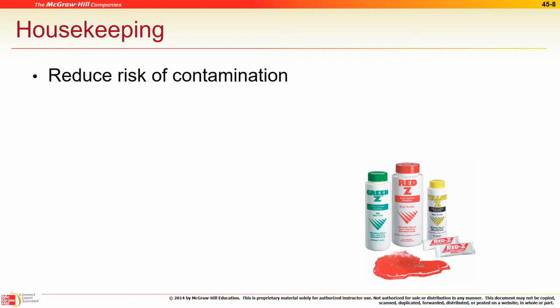Housekeeping. One thing we want to rotate is the pH of our cleaning solutions. So certain things will survive at low pH, that's acid conditions. So next month we'll switch it up to something that's basic. So now we'll kill everything that's acidic. And then the month after that we might switch back to our acid. That way we don't allow anything to grab a hold in our lab.